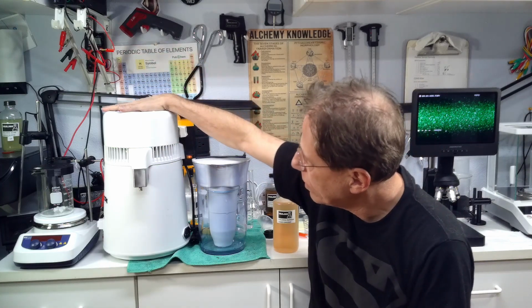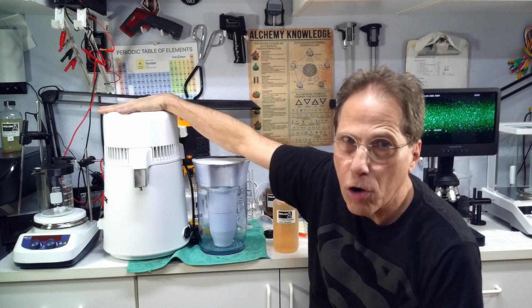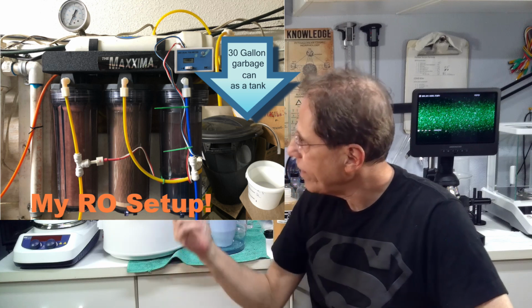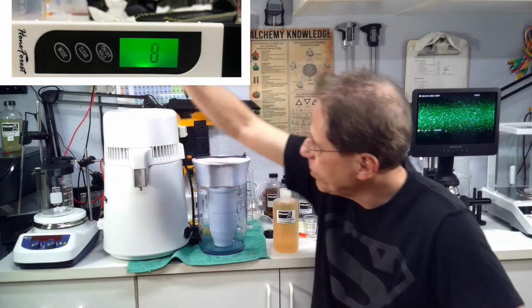Now, the way I use my distilled water is I don't put the well water in the distiller. What I do is I have an RO tank, reverse osmosis tank, which stores about 30 gallons of RO water. And I will take that water, fill up my distiller, and I will distill that water, which is 8 parts per million, down to 0 parts per million. So that's how I clean up the act of my high concentration, 150 parts per million well water. Do whatever you want to do or is most economical for you.